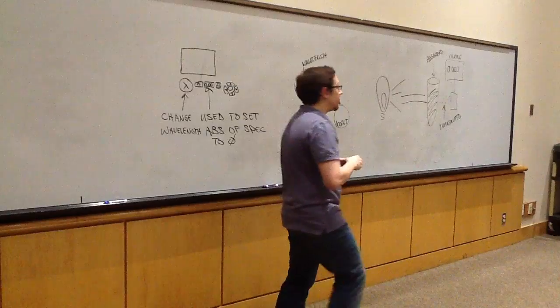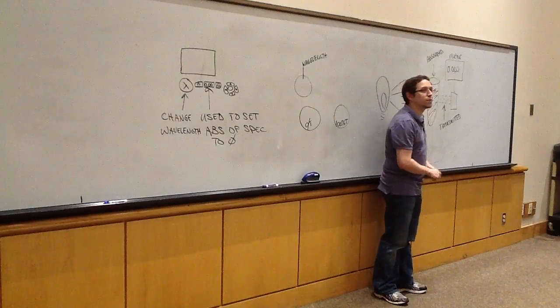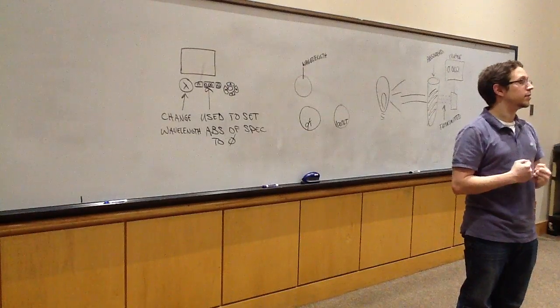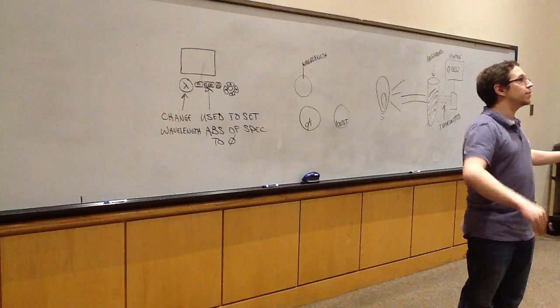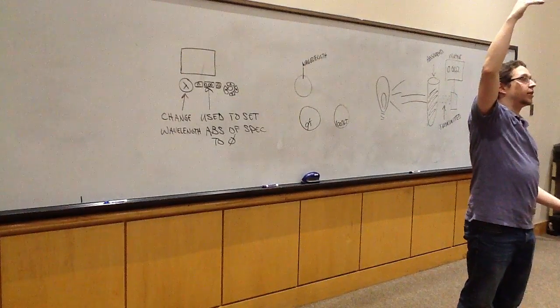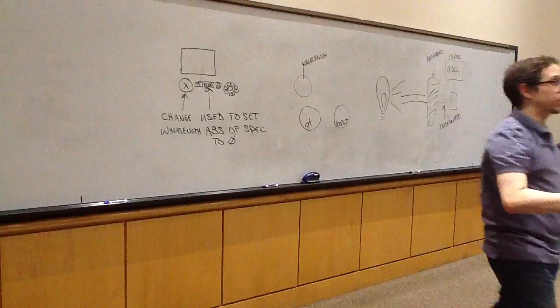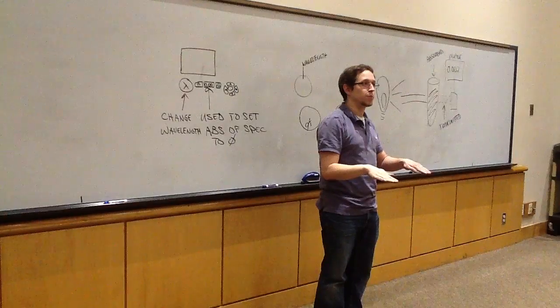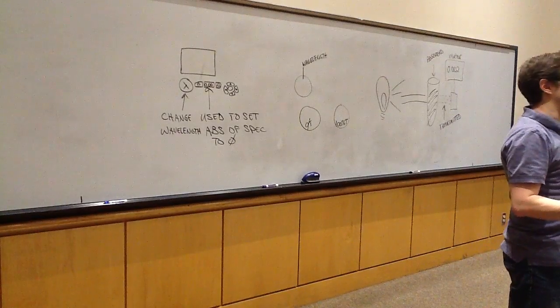Beyond that, though, just in general, let's think about this relationship. So some light is absorbed and some light is transmitted. So if I have a solution that absorbs a lot of light, a ton of it, am I going to see a whole lot of light being transmitted? No. So how does my absorbance compare to my transmittance? If I have a really high absorbance, what am I going to see for my transmittance? Really, really low. Okay? But if that solution is terrible at absorbing light, such that the absorbance is really, really low, what can I expect to see for my transmittance? Really high. So everybody understands there's an inverse relationship between transmittance and absorbance.